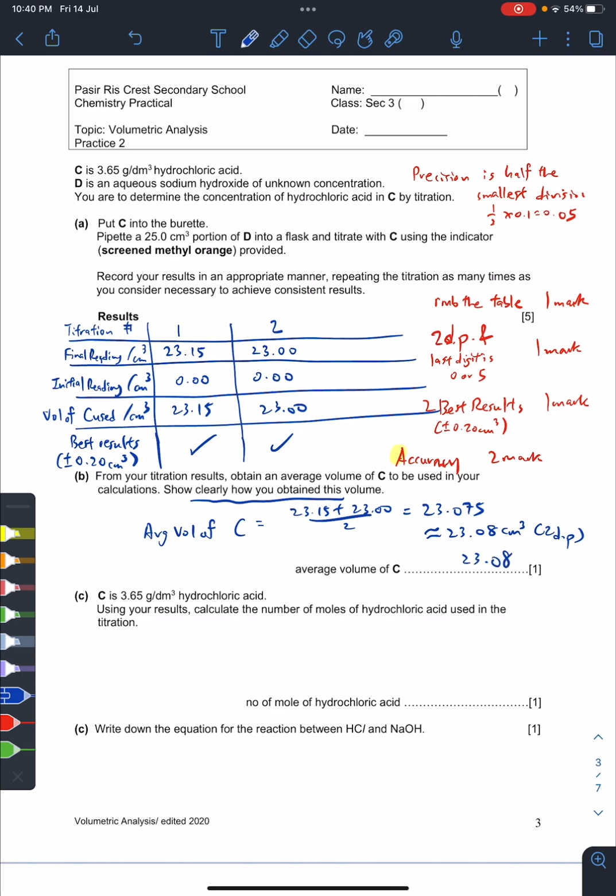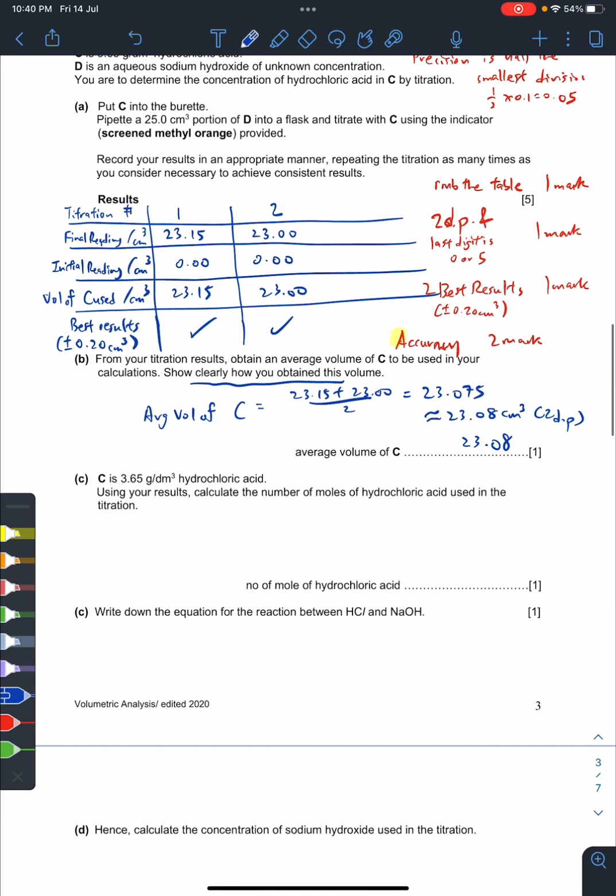.082 dp. So recall, this is a burette. Burette average is still 2 dp. But anything after that, guarantee is 3SF. Okay, next one. You can continue and calculate.